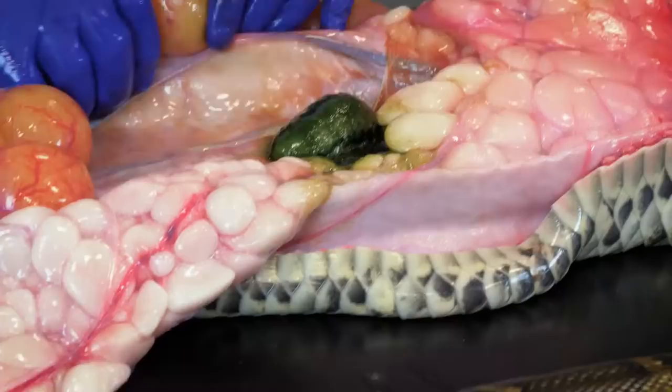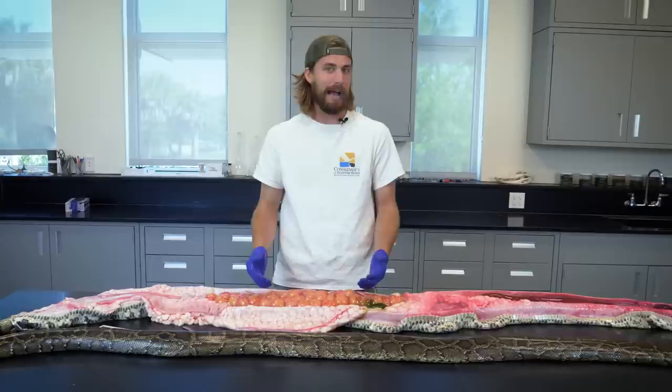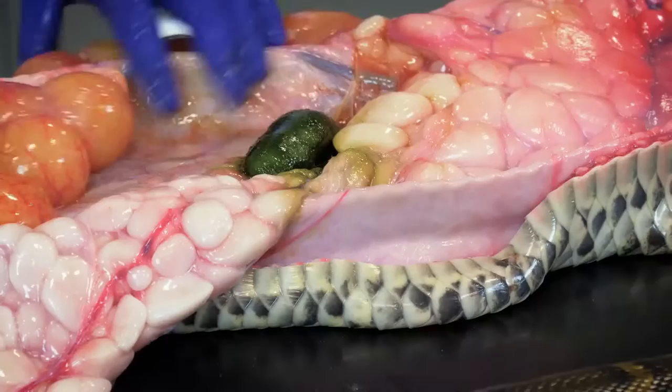I'm sure you're wondering what this big green blob is in the middle of the python — it's pretty hard to miss. This is actually the gallbladder, which is an organ that secretes a fluid called bile that breaks down fats. All the fat inside of the raccoon or the possum that this snake was eating gets broken down using bile from this organ.